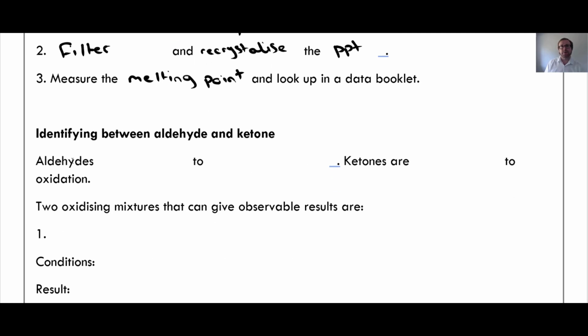However, if we wanted to distinguish between just an aldehyde and a ketone, we could do the following experiments or qualitative tests. Aldehydes oxidize to carboxylic acids.